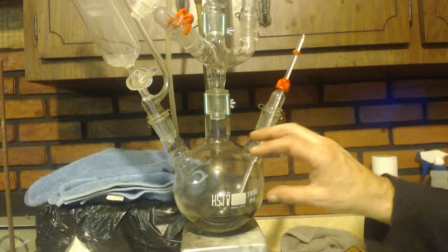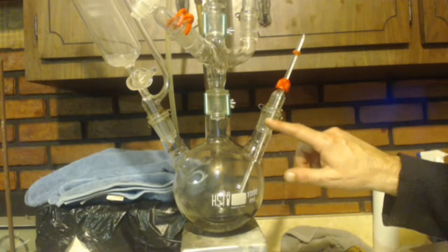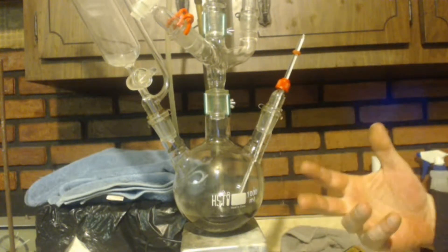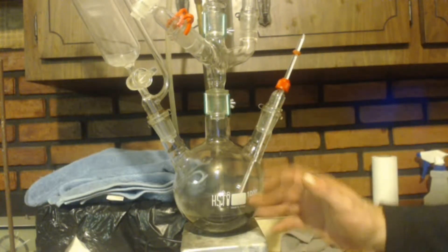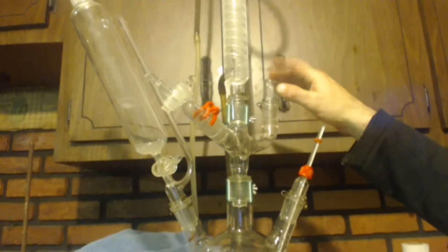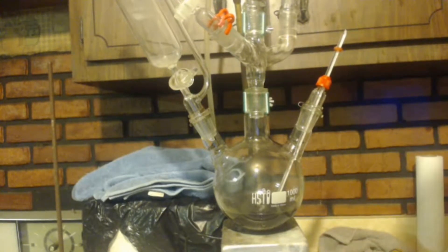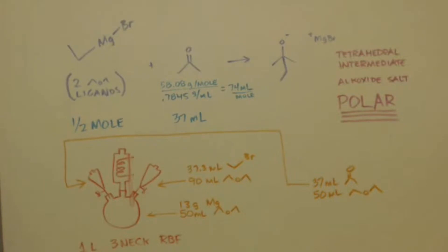The refluxing started at 38°C and went all the way up to 45°C as the ethyl magnesium bromide formed — the boiling point temperature goes up as it's made, which is a good sign. I'm going to let it stir until the temperature starts going down. I'll fill the other separatory funnel with the acetone and diethyl ether mixture and drip that into the ethyl magnesium bromide to conduct the actual Grignard reaction. The acetone is our electrophile.